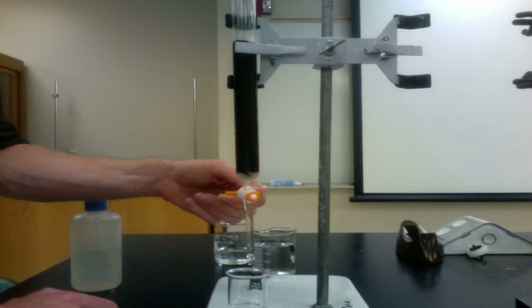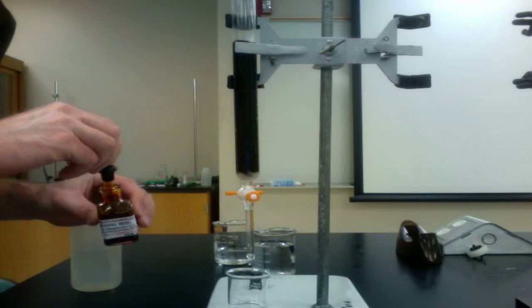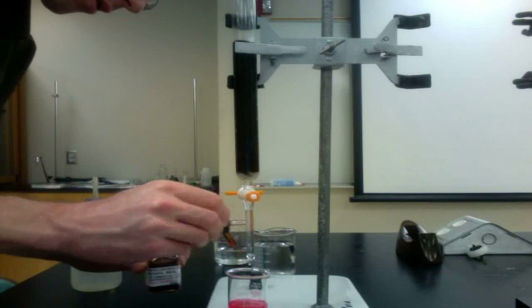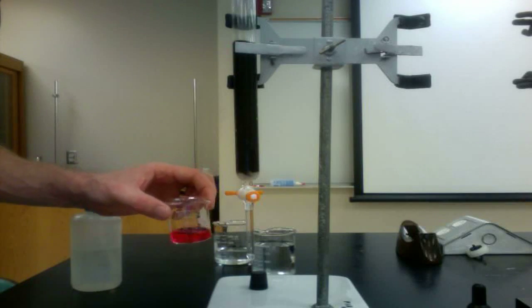It is important to test the column effluent to be sure all the acid has been removed. Collect a small volume of liquid and add some methyl red indicator to it. If the liquid remains red after a drop of sodium hydroxide has been added, the column is not yet fully rinsed and requires further rinsing.